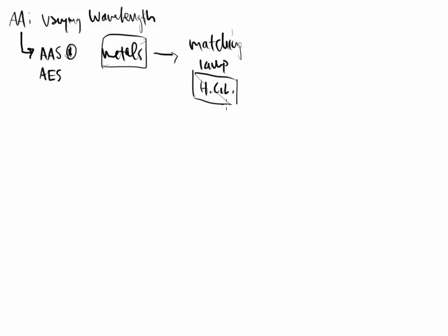So H, capital C, capital L. HCl is hydrochloric acid, and that can be used in atomic absorption spectroscopy. The problem, though, is that you've got to be careful. What is it really talking about? So HCL is the hollow cathode lamp, or the bulb that makes the machine work.